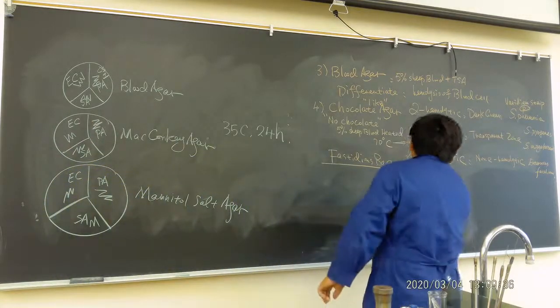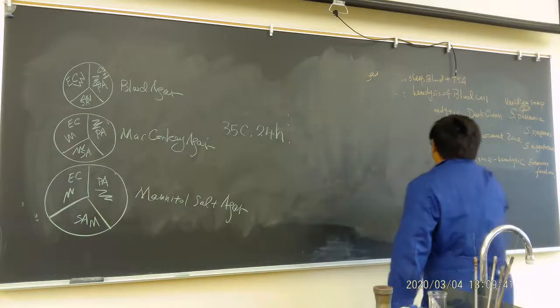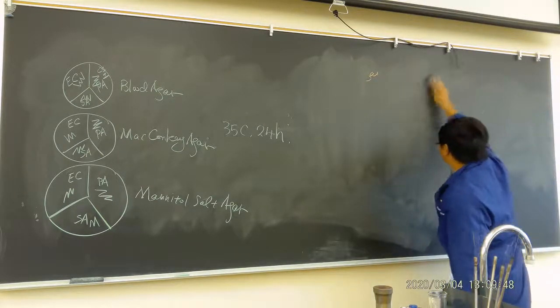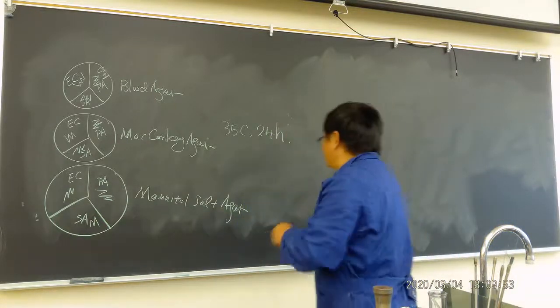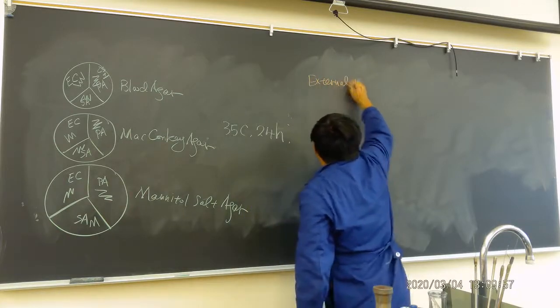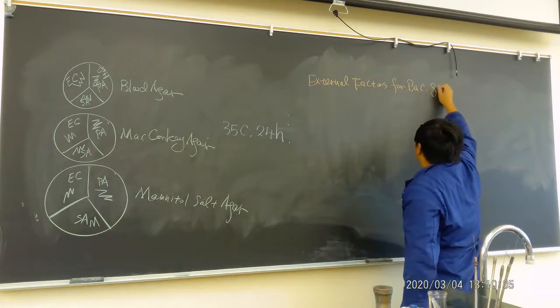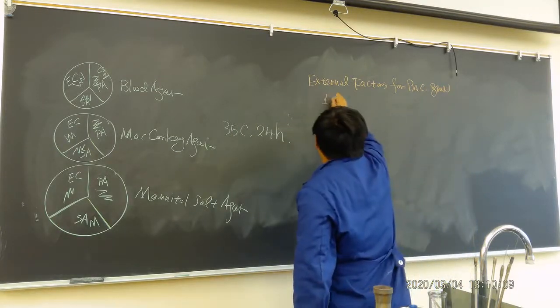Okay, now the second job we will do. We will see the external impact, or we say environmental factors, for bacterial growth. This includes temperature.